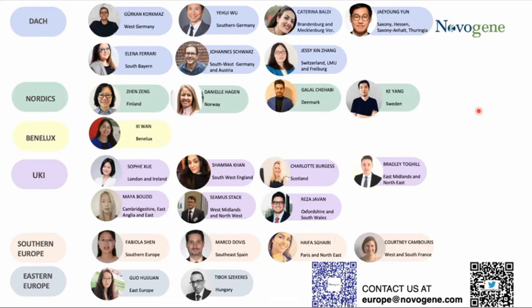So PCA is definitely included in the 10x single cell RNA-seq, but for the correlation analysis, I don't think we have that part in our pipeline right now. And for the single cell RNA-seq analysis, they will perform a little bit differently using different software and algorithms to run the differential expression analysis, because they want to find out the most variable markers first, and then they will move forward with that information.